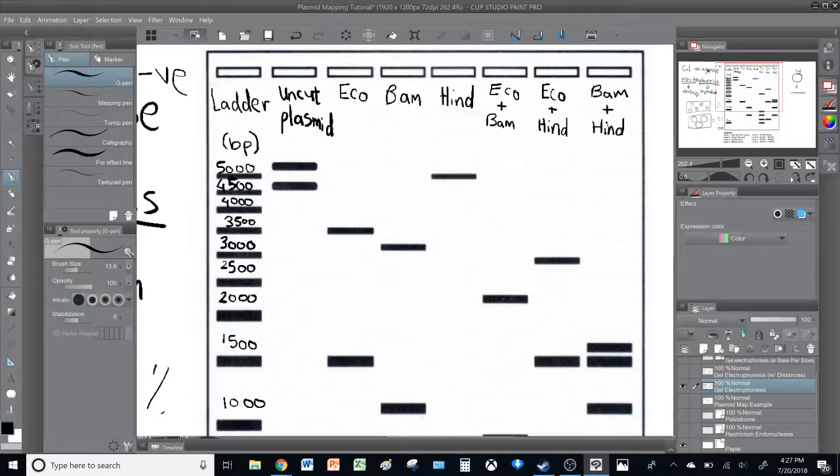So the way you would measure the distance traveled, if you're using a software like Photoshop or Clip Studio, like the one I'm using currently, which was known in the past as Manga Studio, I believe there's some sort of a digital ruler where you can place a point and then drag it to create a line, and then it will tell you how many pixels or how many centimeters it is. Unfortunately, I am new to digital art, so I normally print this paper out and measure it with a ruler.